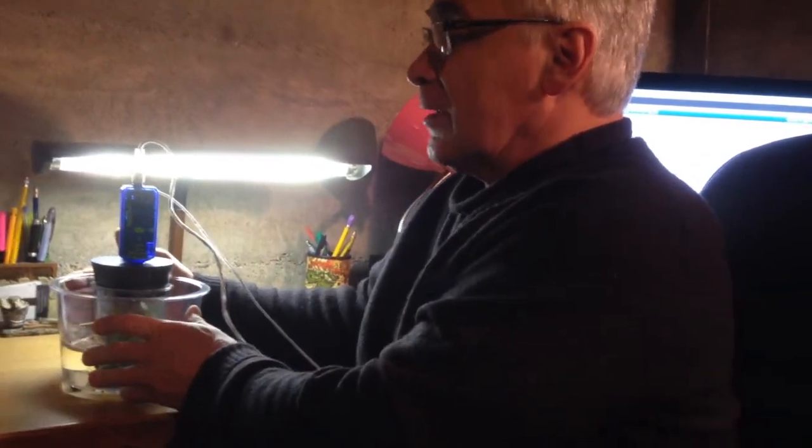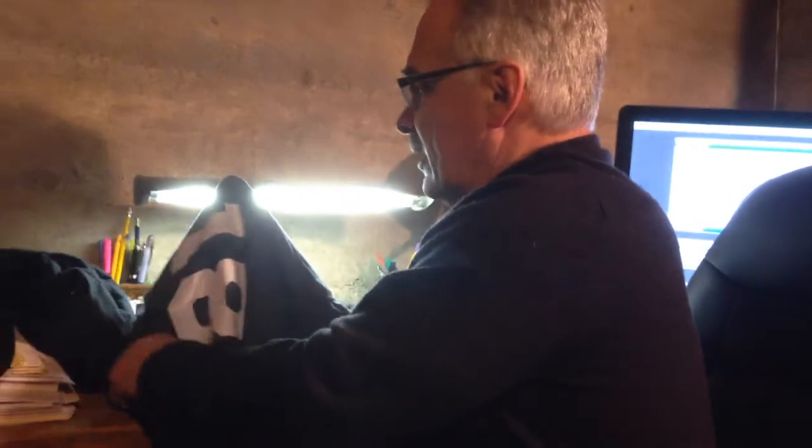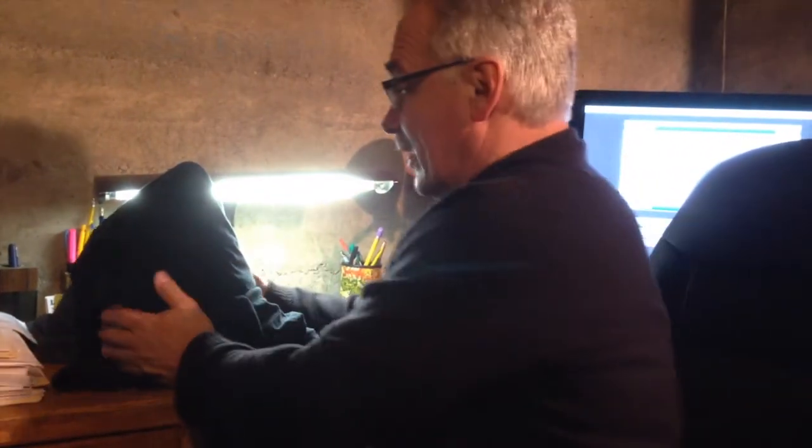The very first thing I'm going to do is cover these just like this, so it doesn't get any kind of light in it, so it'll be completely dark. Then we're going to go ahead and hit play, and in 10 minutes I'll get back with you. So I've got this all covered up, and we're going to take recordings while it's in the dark. We'll measure CO2 and oxygen, and then I'll get back to you around the 10-minute mark.